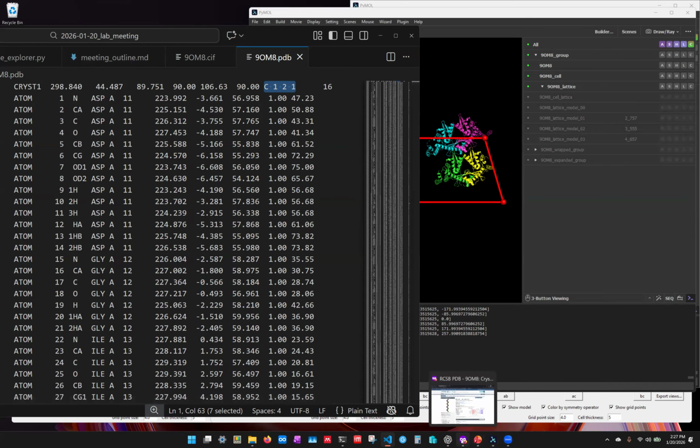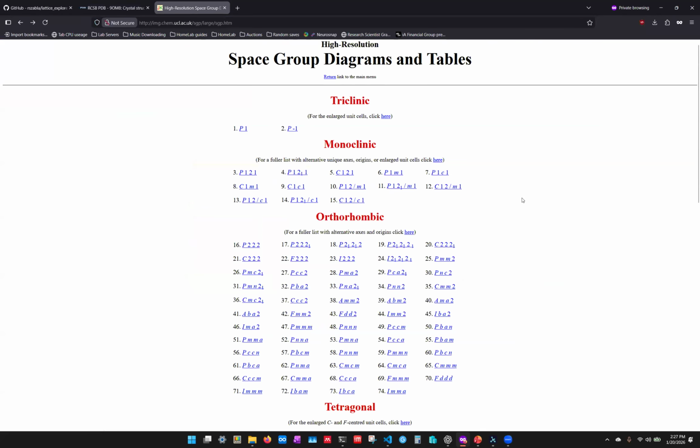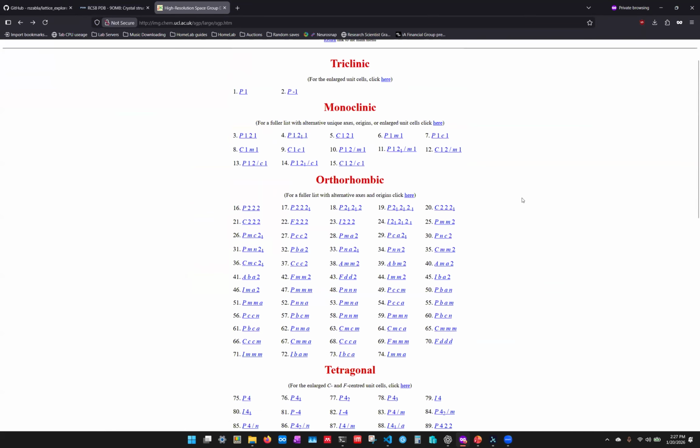And what does that really mean? You could take either a crystal lattice, or you can tile a driveway or some tiles or whatever. Literally, Alva and I, when we were postdocs together, we used to go around and think about things that we would see and figure out what space group. Oh, look over there. There's a C121. Yeah, exactly.